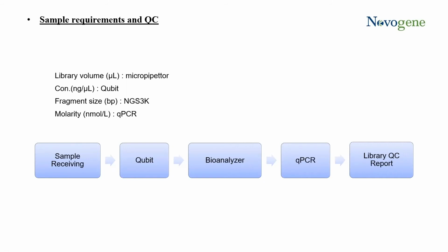So the way that our workflow progresses is that we shall receive your samples the way that they're sent to us. So if you are multiplexing or if you are not, so if you're creating a pool of libraries or sending us individual libraries in a tube, we'll perform the following steps on all tubes that are given to us. So we need to find out the volume. We'll run it on the bioanalyzer and the Qubit.